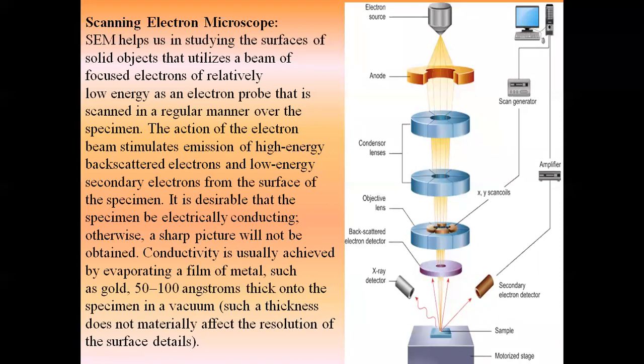The electrons falling onto the sample may either be deflected, or reflected back, or there can be X-ray generation.